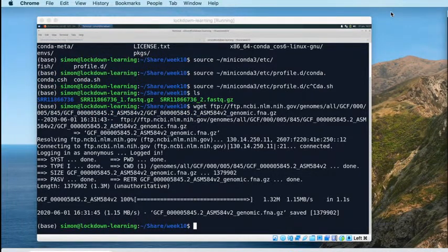So that's the Burrows-Wheeler transform. We've downloaded some data. Tomorrow we're going to use the Burrows-Wheeler transform to align our FastQ reads to our FastA reference genome, which we downloaded. So we downloaded those two things at the beginning, and that's what we're going to do. Not tomorrow, Wednesday. I've got to get used to not doing this every day. It's going to be Monday, Wednesday, Friday. So the next one will not be tomorrow, it's Wednesday.